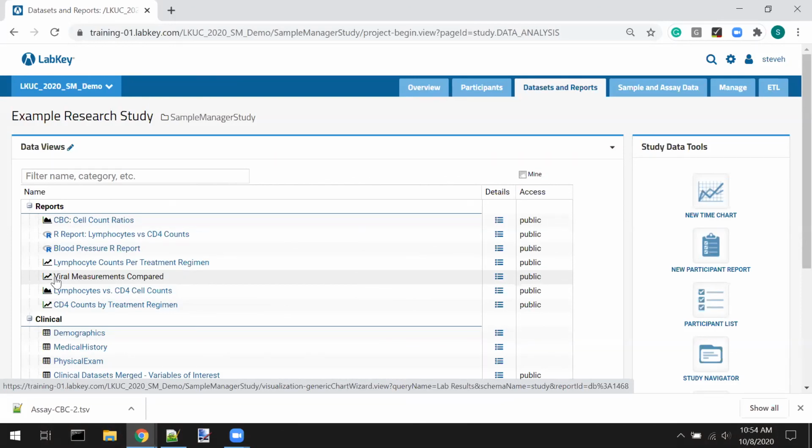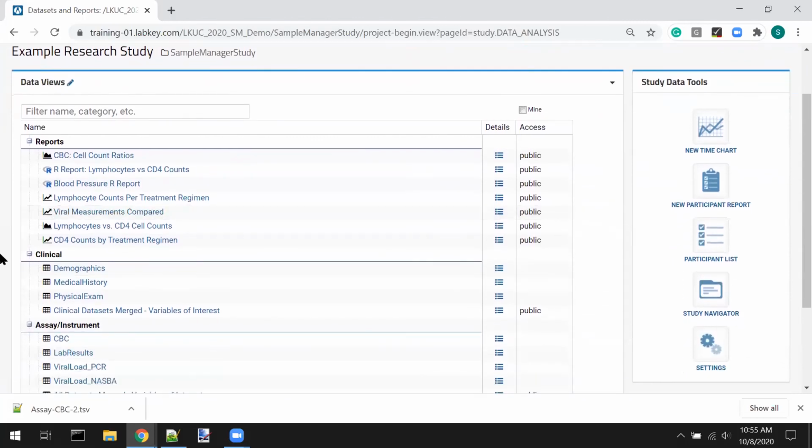And then, what is involved to initiate Sample or Freezer Manager if you already use LabKey Server? So this actually goes, I think, with a few other questions that people have been asking. If you have a premium edition of LabKey right now, Sample Manager is available. If you've got a release this year, so starting at 20.3 or later, Sample Manager is actually an option when you create projects or update your folder. You can add the sample management module, and that will be available directly.